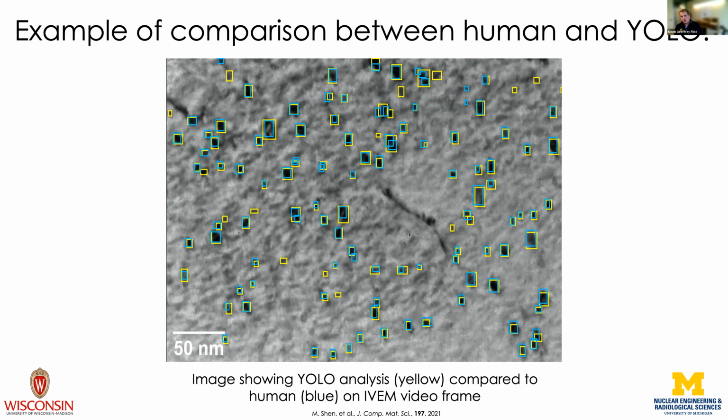It's about 85%. The YOLO code, in the case of this particular data, is highly constrained for this particular experiment, but we were getting F1 scores of about 85 to 93%. So we're getting human level performance, if not above human performance in our detection. But now I don't have to have graduate students or other researchers do that labeling. I just let the machine run it. You can also think about that: I could give you the code, you could run it on the same images and get the same answer. So we're removing bias and increasing our temporal and spatial resolution in our analysis.